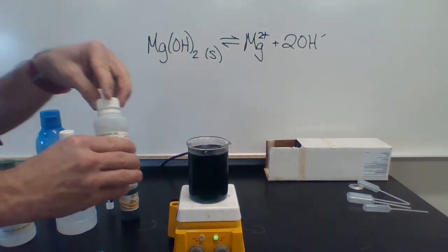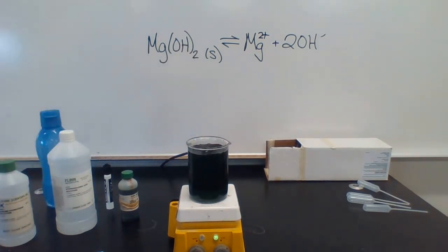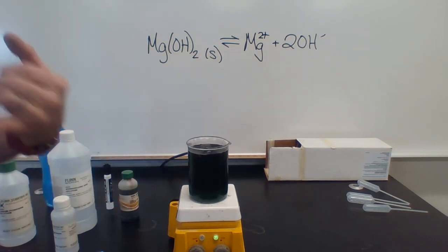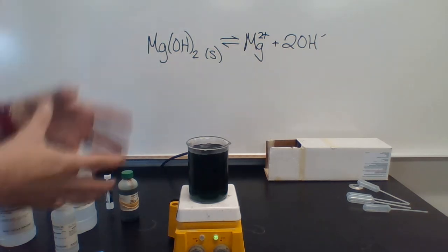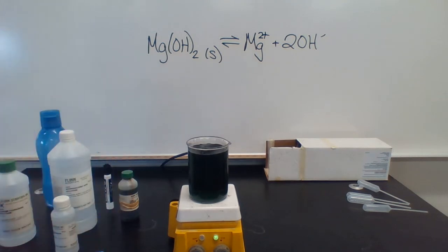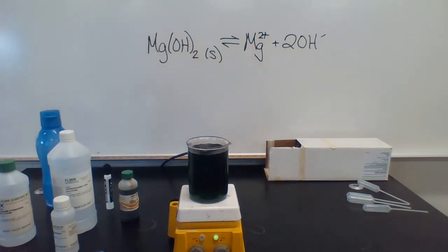The other thing that I have here is magnesium nitrate. Extra magnesium can also shift the reaction. And it's hard to see in this video, but we're starting to see a little bit more solid float around. And you may or may not have noticed it initially, but it was very cloudy when it was purple or lavender. And even when it was blue and green the first time, it was cloudy. That's because there was a lot of solids still floating around.